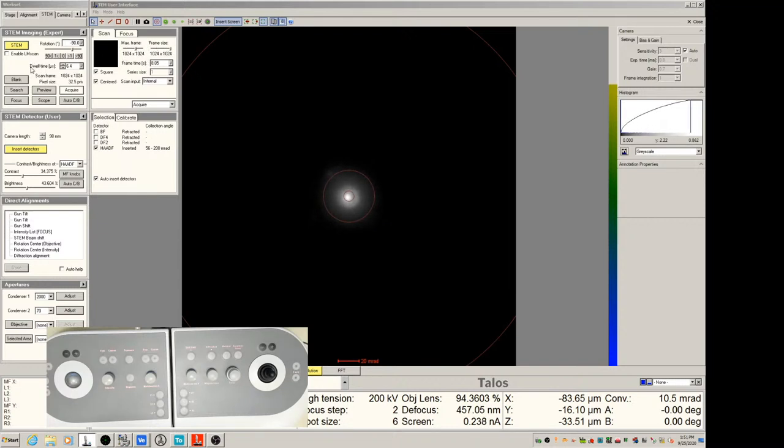So here you have dwell time, 6.4 microseconds at each pixel is good. Also, you can increase to 12.8. I won't go higher than this because that's gonna be a very slow scan, and your image is gonna suffer from the sample drift a lot. So let's do this.